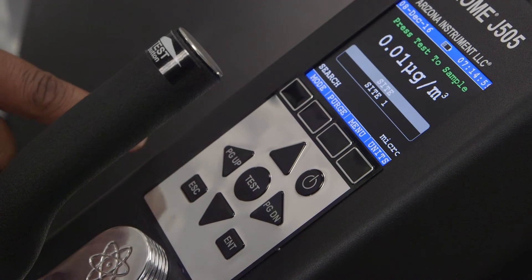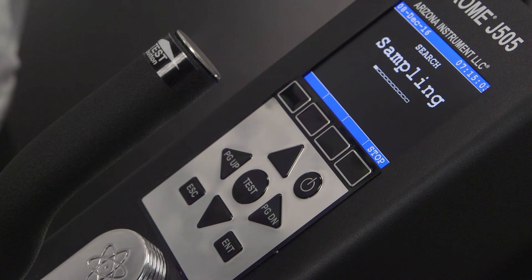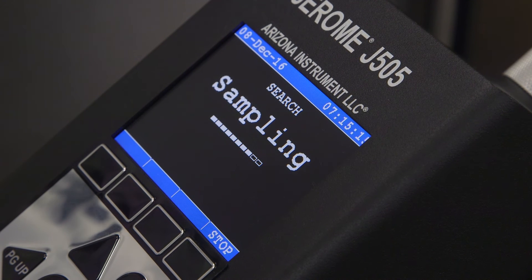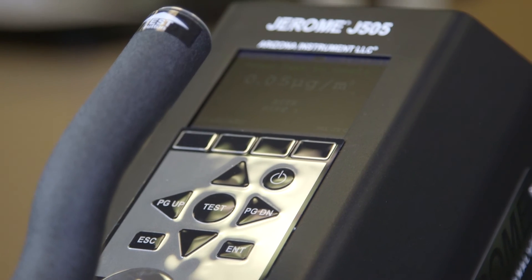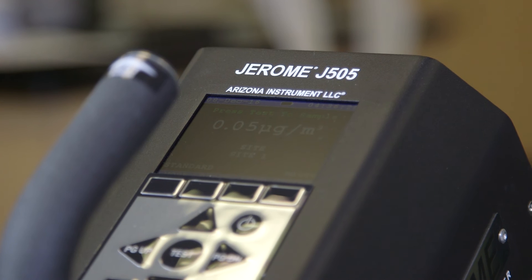All test results, excluding those taken in search mode, are stored in the J505's integrated data logging system, which can hold up to 10,000 data points. If the memory becomes full, a notification will appear reminding you to erase old memory points. It is important to note that any samples taken with full memory will not be stored in the integrated data logging system.